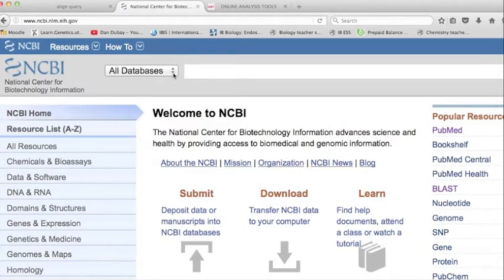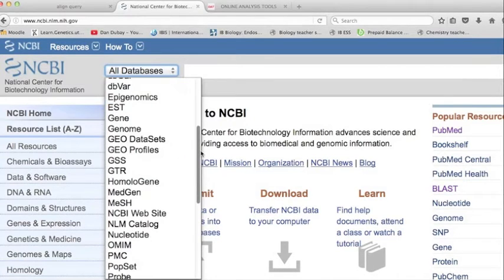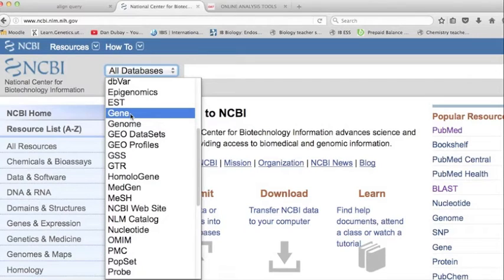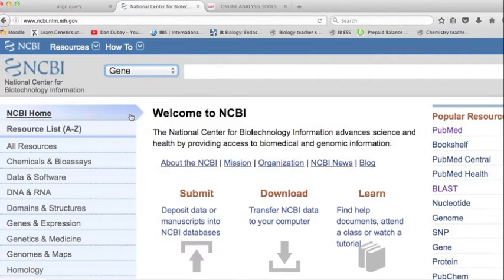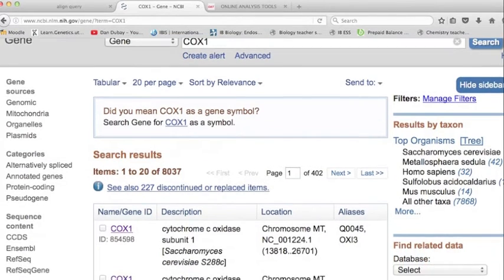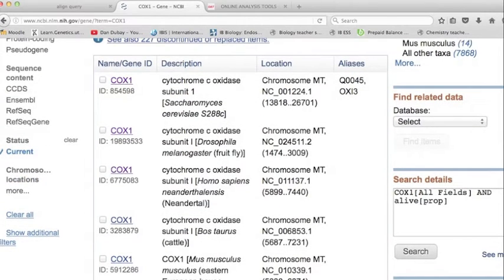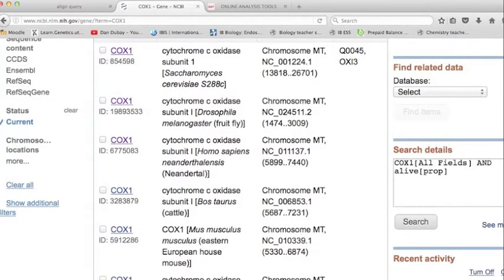Go to the NCBI website and select gene. Type in the gene that you want — in this case, COX-1 — and search. Here you see 8,037 results, but the genes that we search for will all be found on the first page.